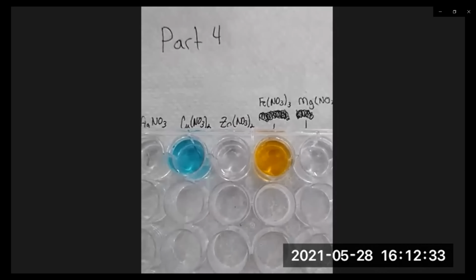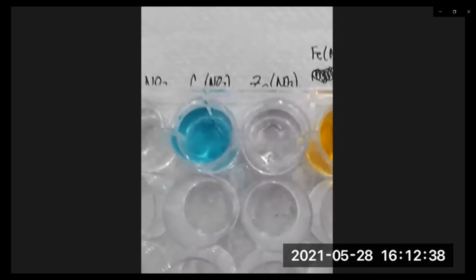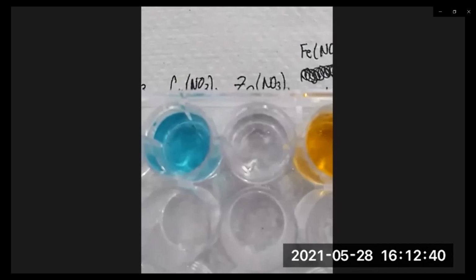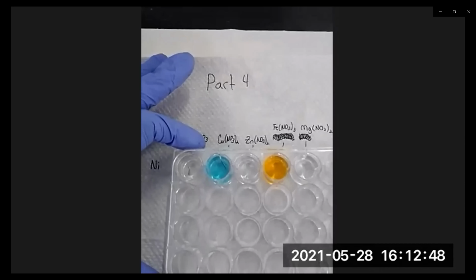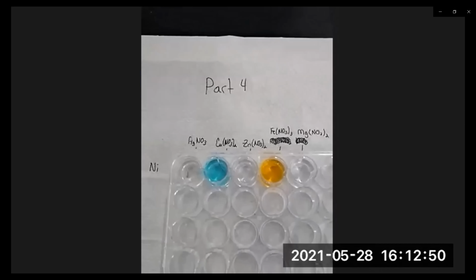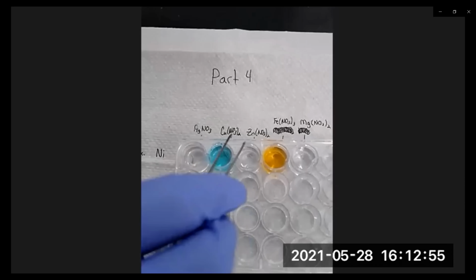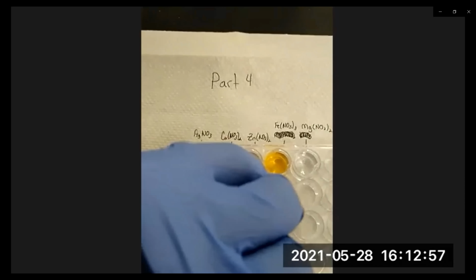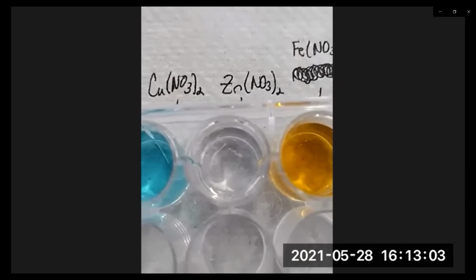Next, we're going to add one to the zinc nitrate solution. You got to be careful because sometimes the metal sticks to the forceps.